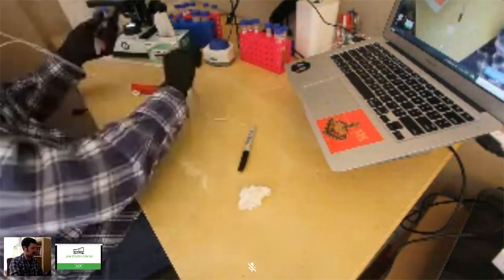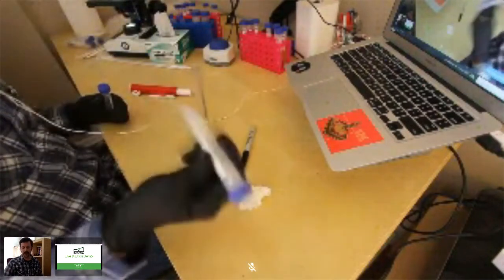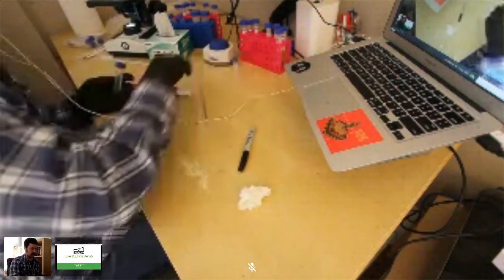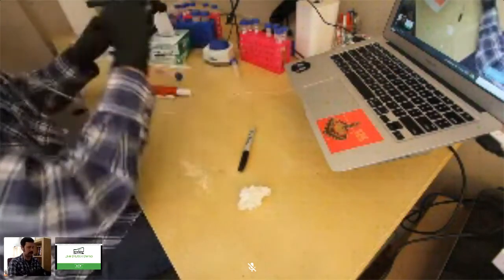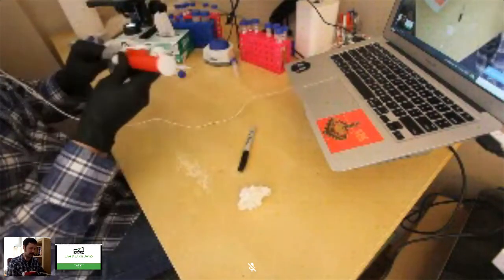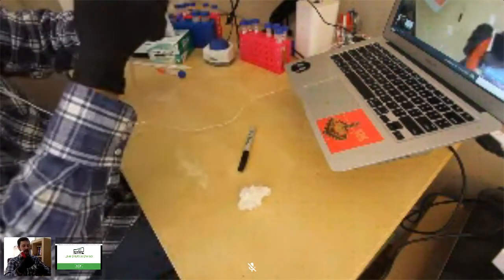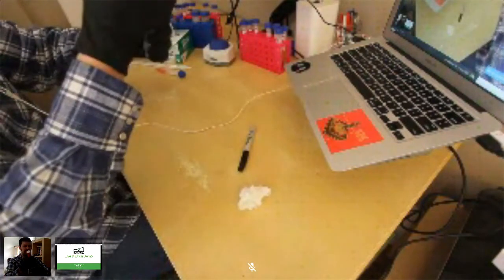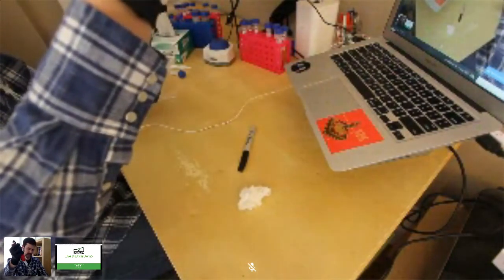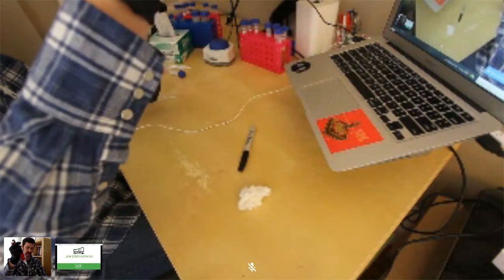So again, I'm going to take my 1 in 100 sample. I'm going to shake it up, make sure everything's nice and in solution. And then I'm going to pull a 1 mil sample, and then add that to my 1 mil of erythrosin B. So again, I'm going to collect my 1 mil.